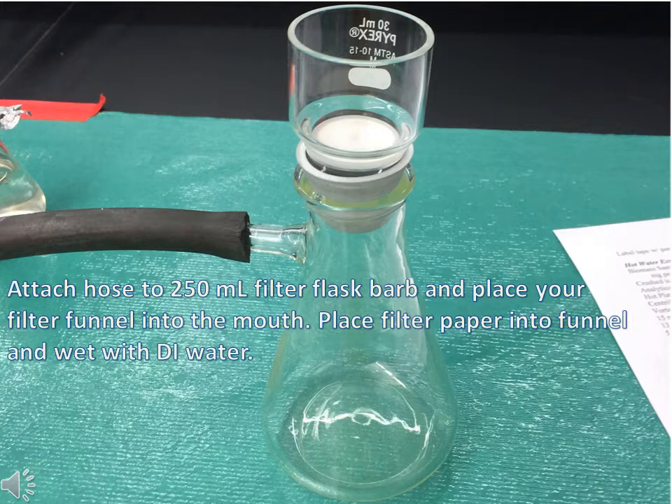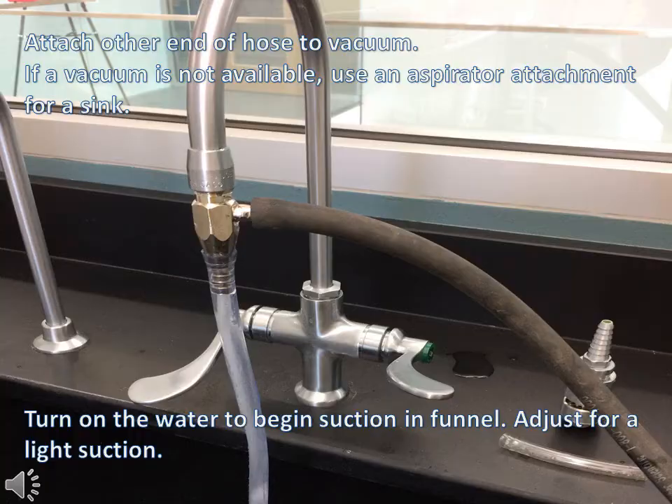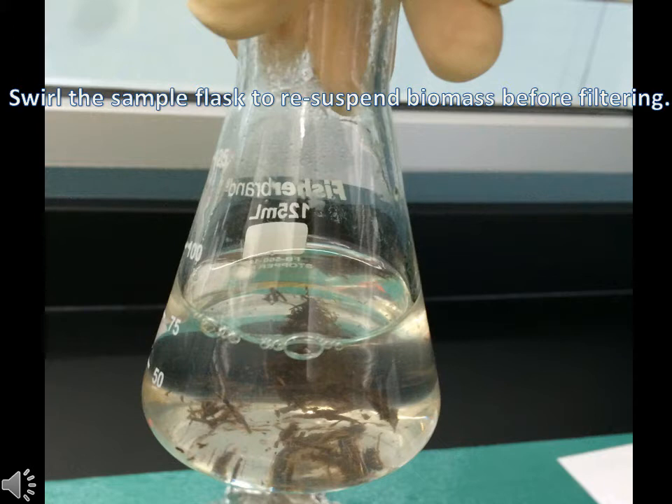Attach the vacuum hose and the Buchner funnel to the filter flask. Grab the filter paper, place it into the funnel, and then wet with DI water to seat the filter into the funnel. Attach the other end of the vacuum hose to a sink aspirator or a vacuum nozzle and adjust to a light suction.